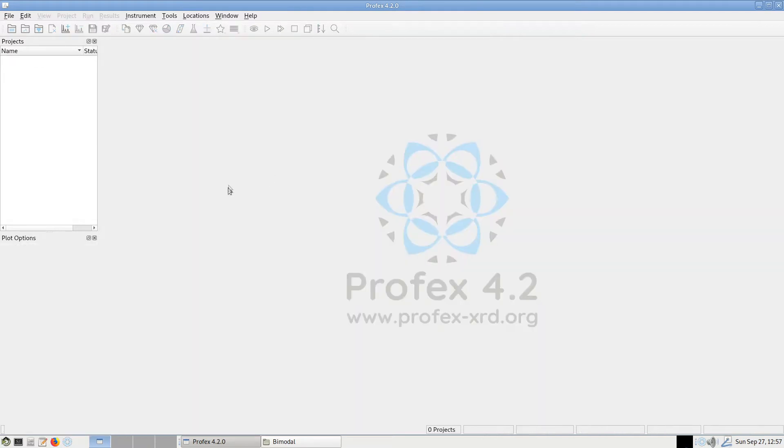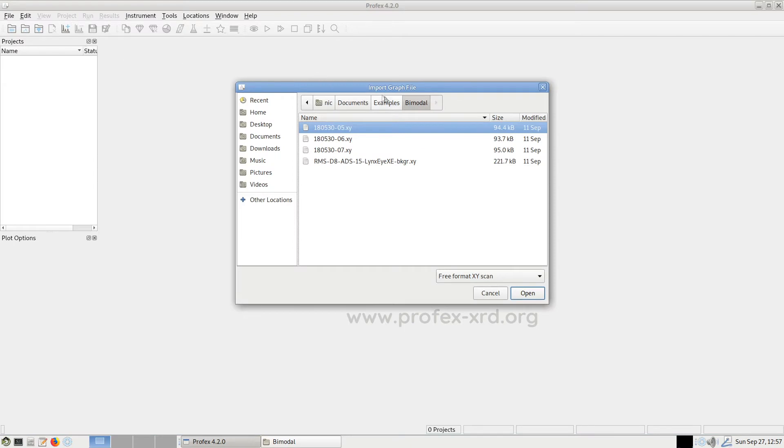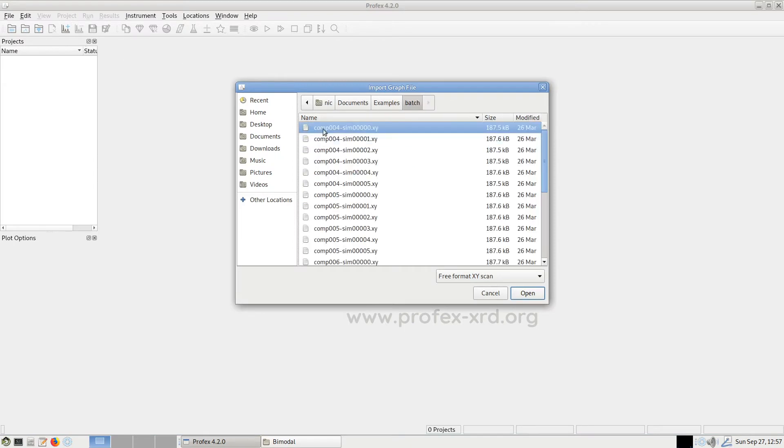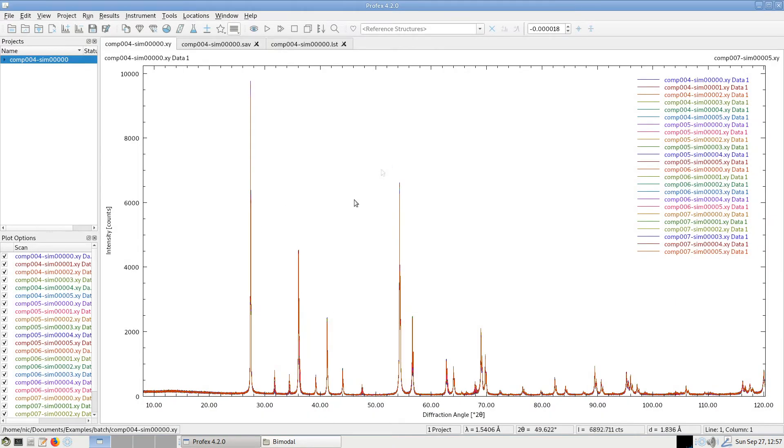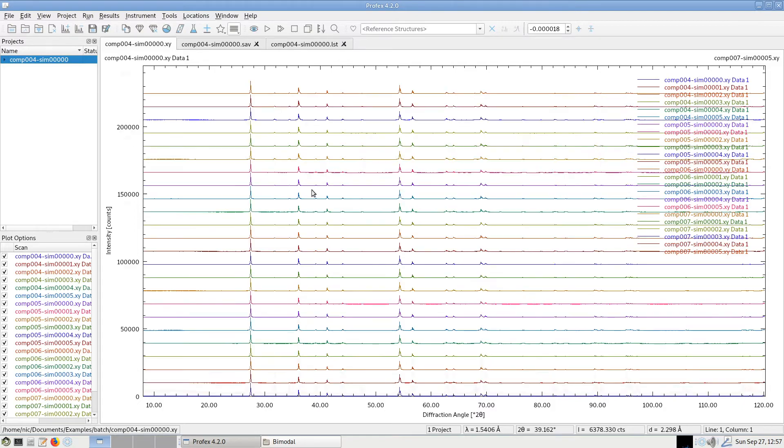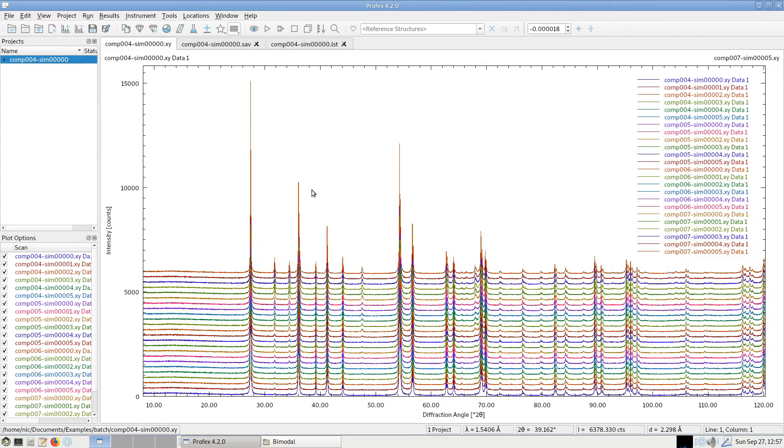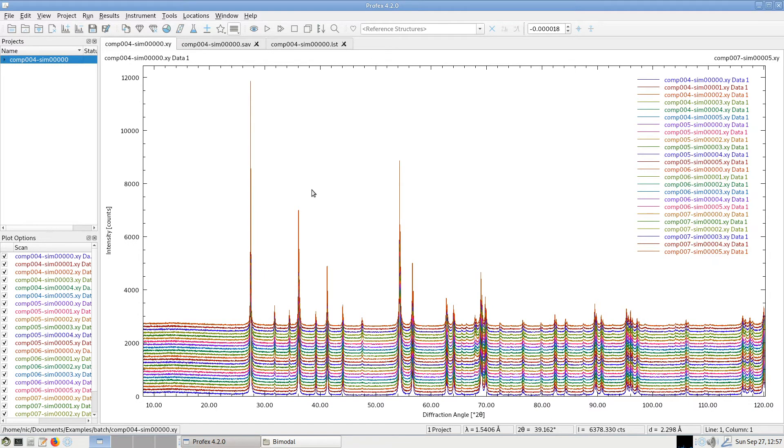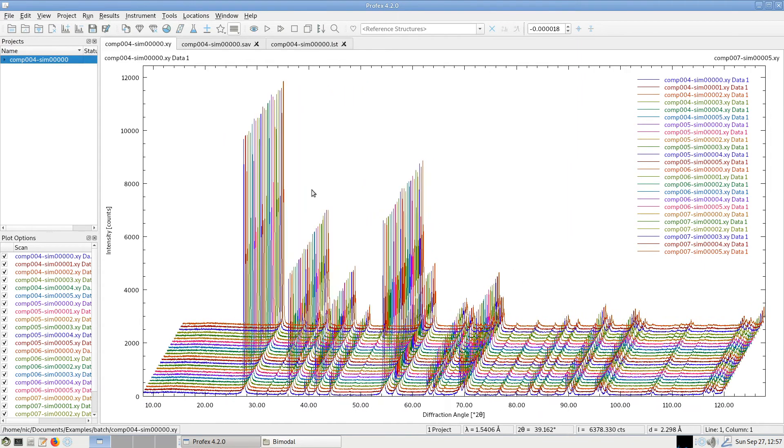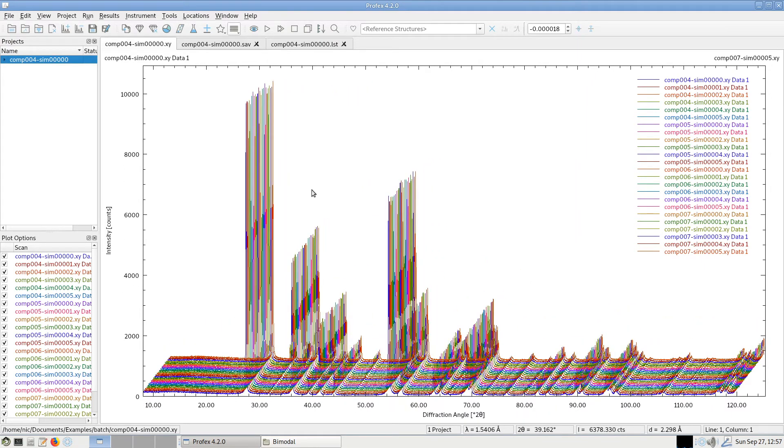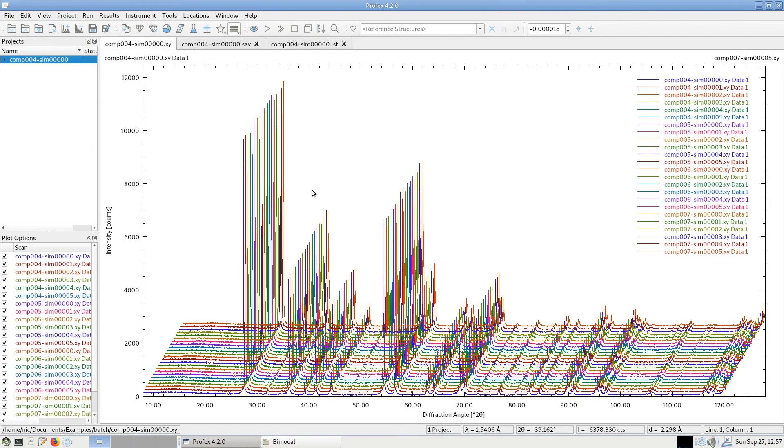If we want to combine many measured scans in one graph, we can use the insert scan button and open a large number of scans in the same graph. And now if we use the stacking function and reduce the vertical offset, and we can also apply a horizontal offset at the same time, we can create scans that look or graphs that look almost three-dimensional. Which is a very good way to represent changes in, for example, sequential measurements.